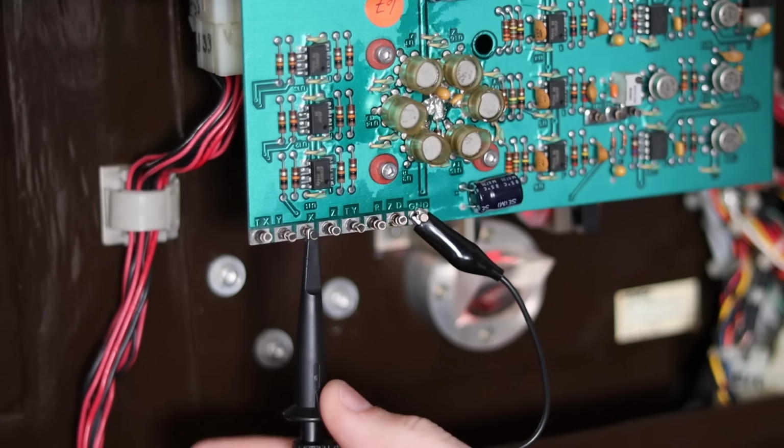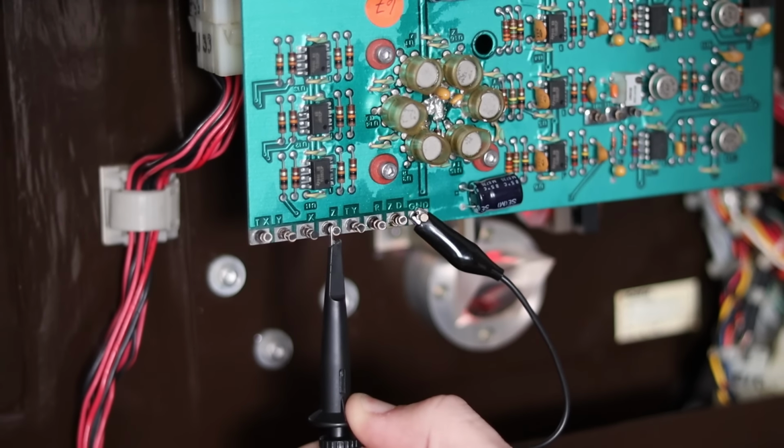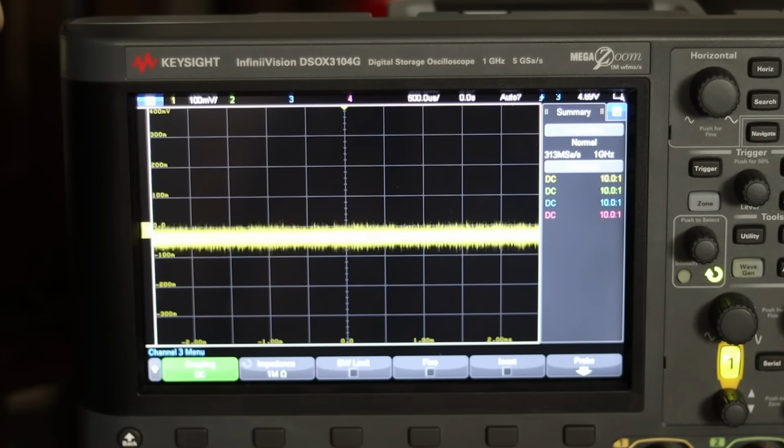And that sensor is visible on the Z pin of the sensor board on the back. The white light is emitted from this little lamp up here, and if I block the light with TechAV's card, over on the scope we can see the DC offset jump around. So the light is actually very close to being aligned.